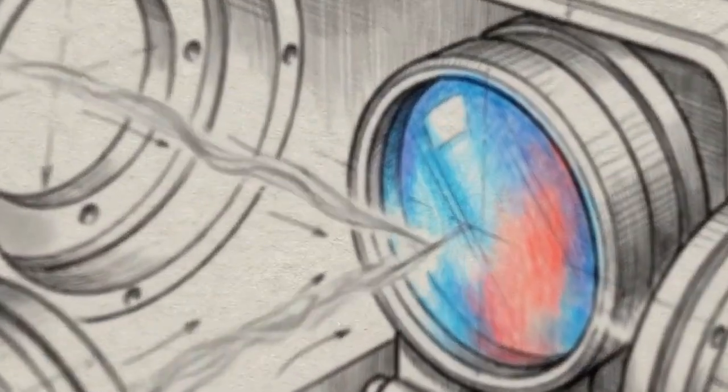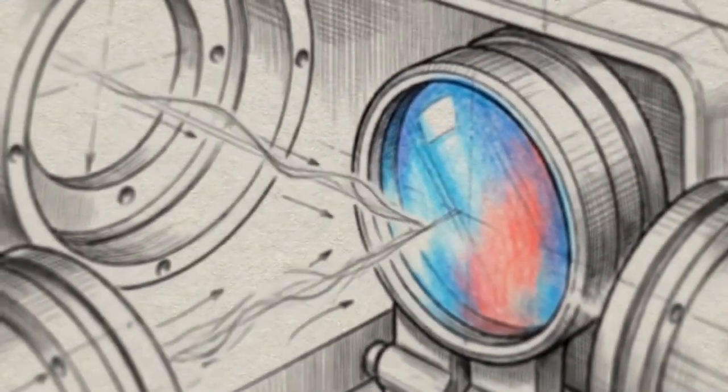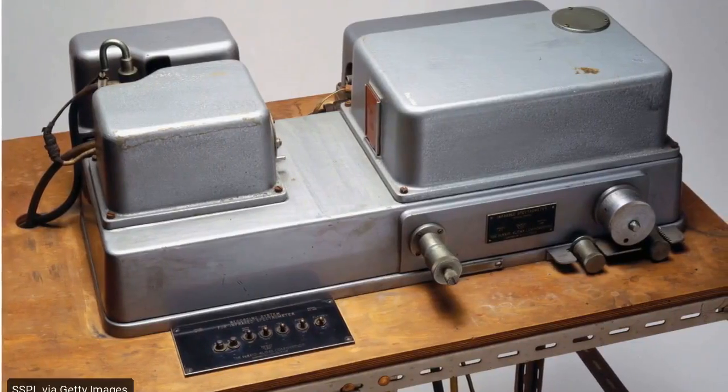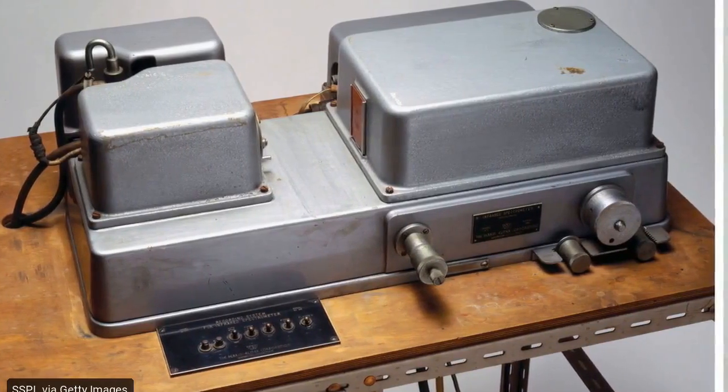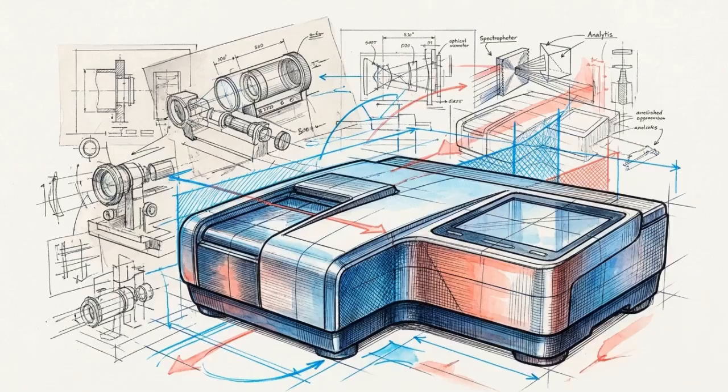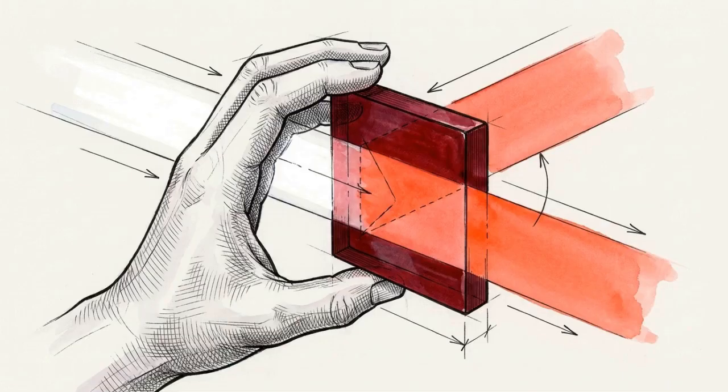High transmittance ensures enough photons reach the detector for a stable signal. Every wavelength selector ever engineered forces a strict compromise. Squeeze the bandwidth tighter to gain resolution, and you sacrifice the raw transmittance needed to measure it. To understand how modern instruments navigate this limitation, we have to look at how these optical compromises evolved, starting with the most basic method available.